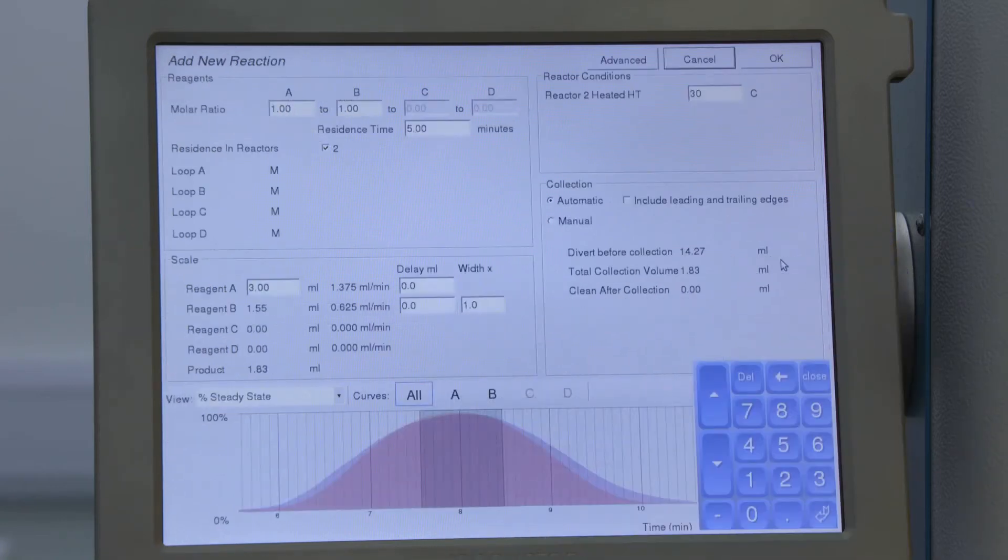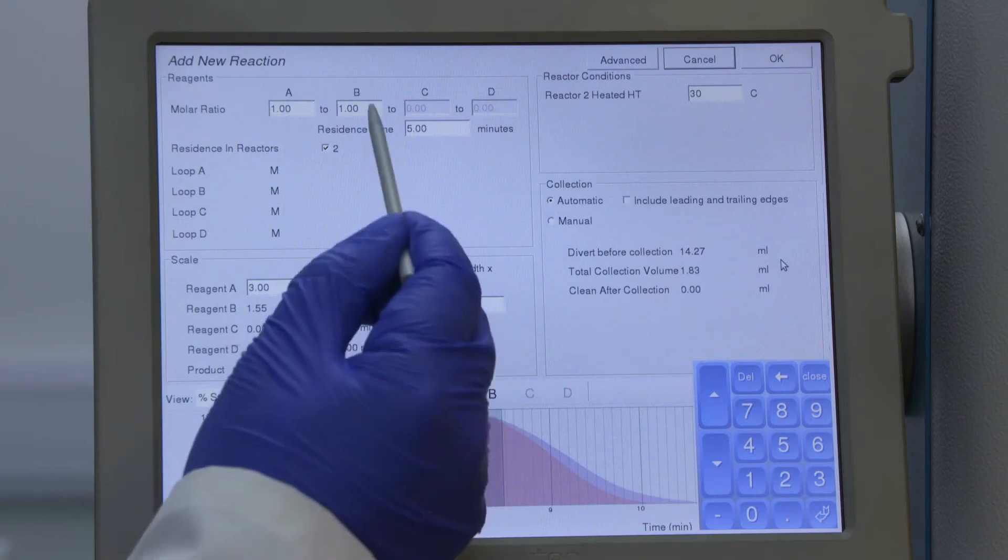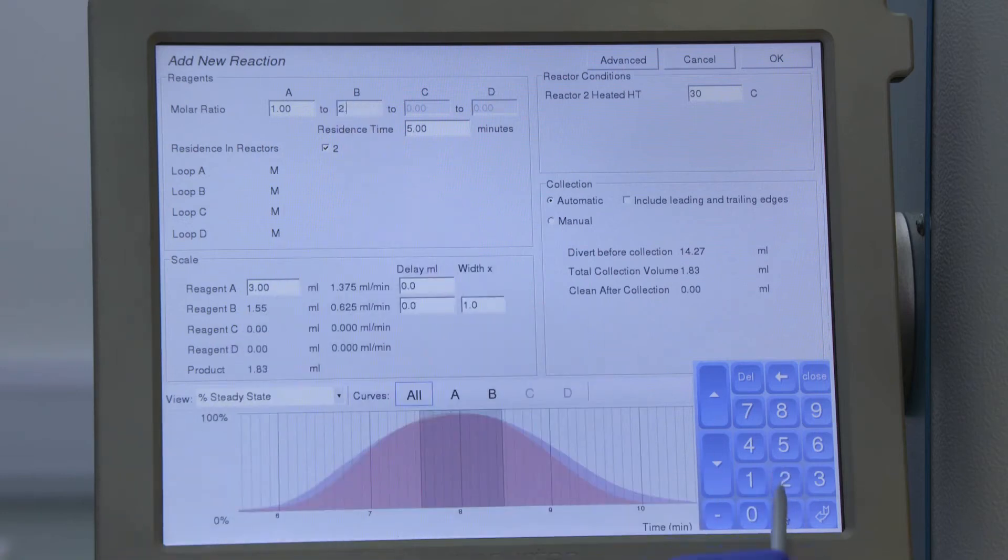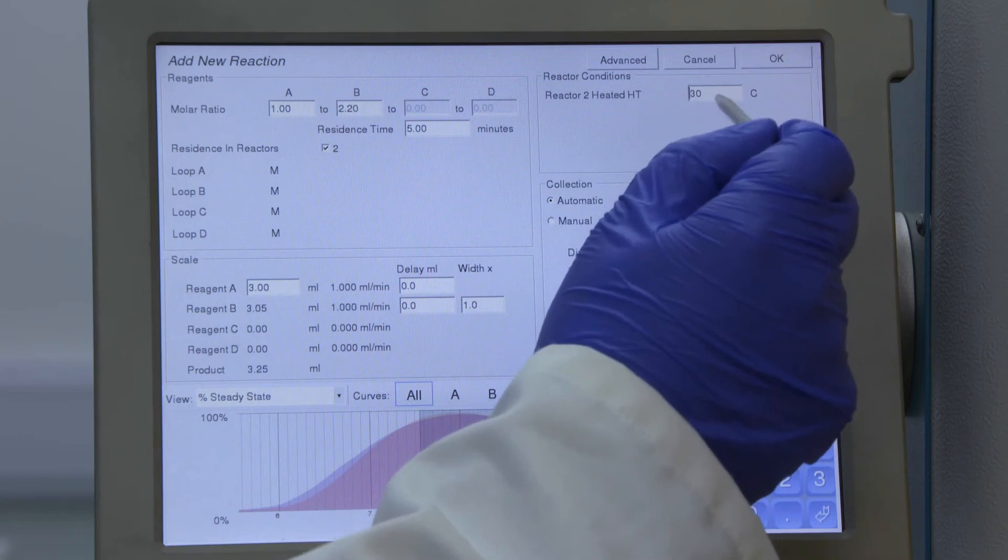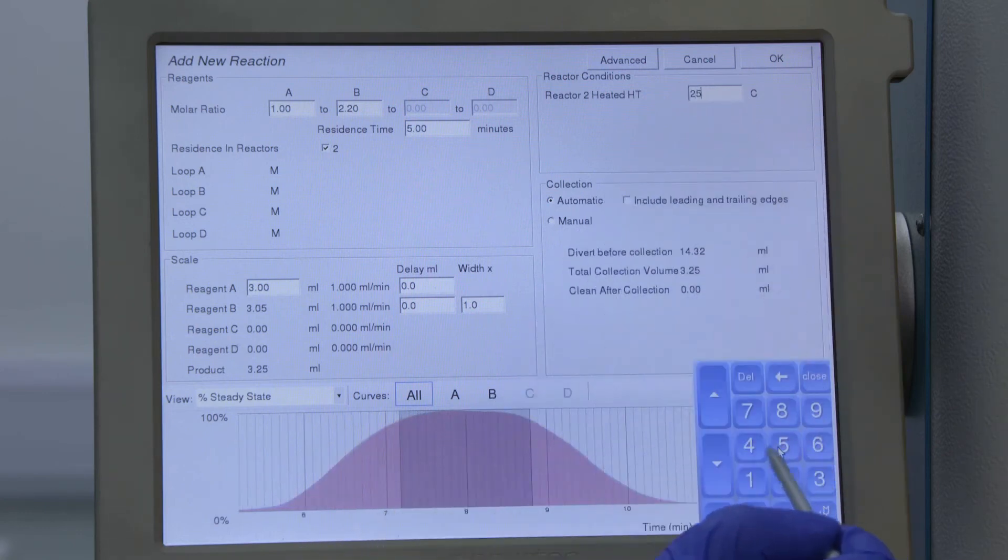On this screen I get to define the actual reaction parameters. So what molar ratios of my reagents I want, what temperature I want the reaction to be, and how much reagent I want to use.